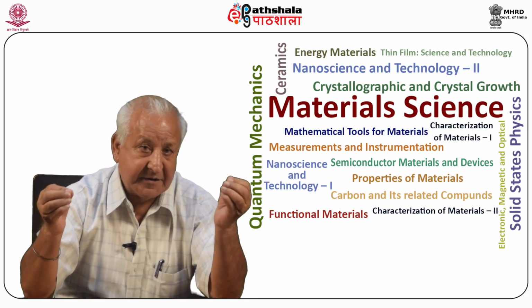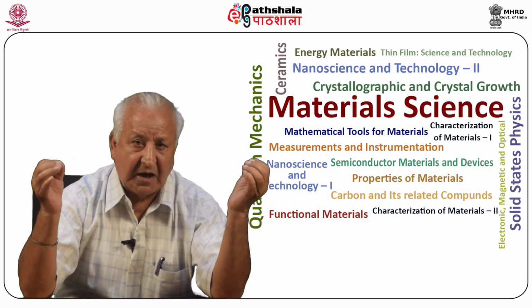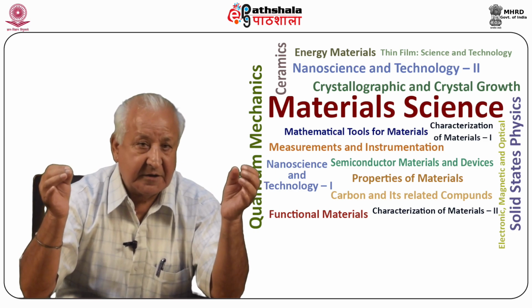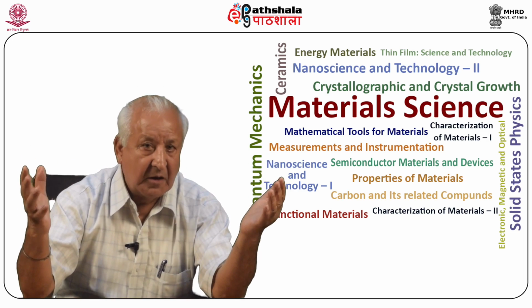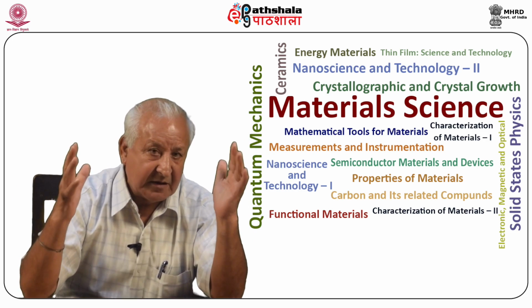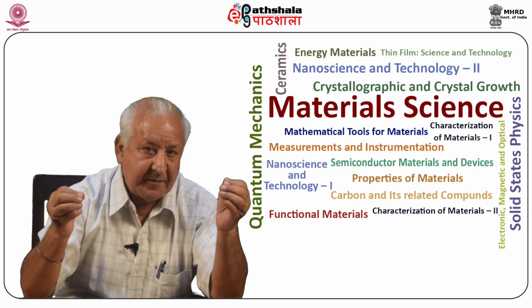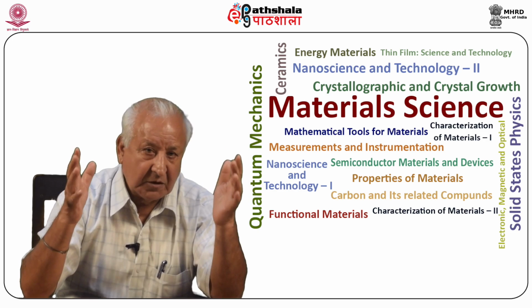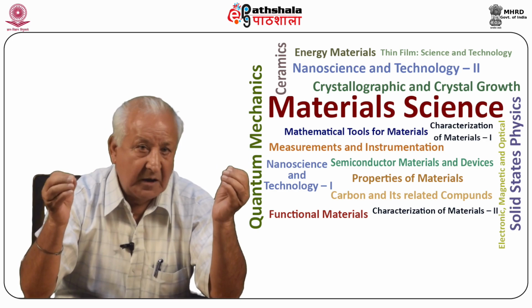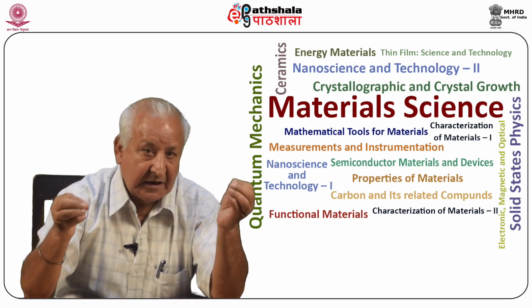Growth by chemical reaction. The method can be taken as the basis of all methods of gel growth, and is actually crystal growth by chemical reaction. The crystals, which are insoluble or slightly soluble in water and decompose before reaching their melting points, can be grown by adopting this procedure. The basic requirements of using this method for the growth of crystals are: the reactants used must be soluble in the solvent, whereas the product crystal must be relatively less soluble.